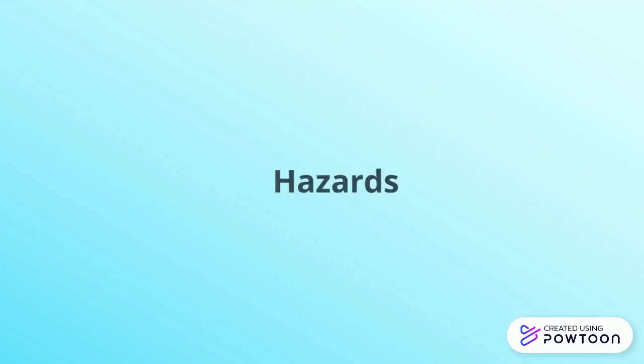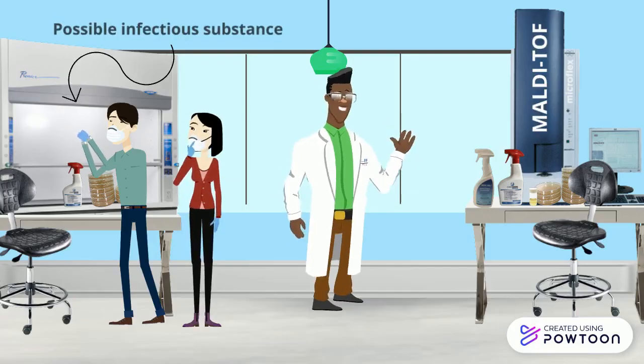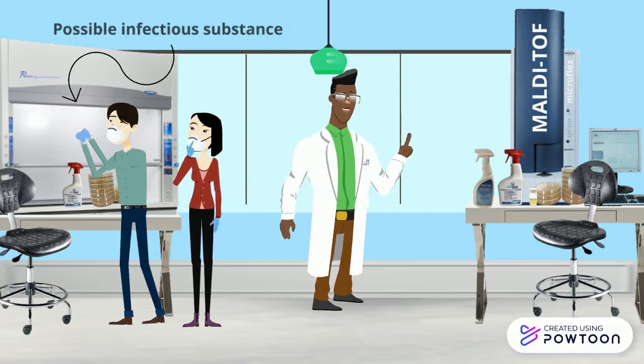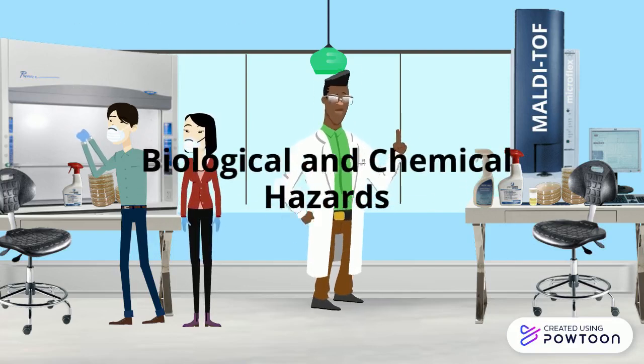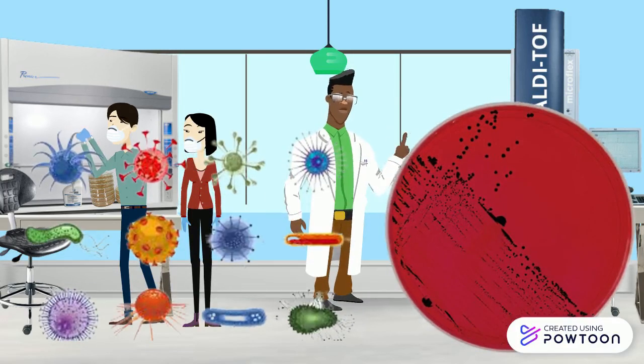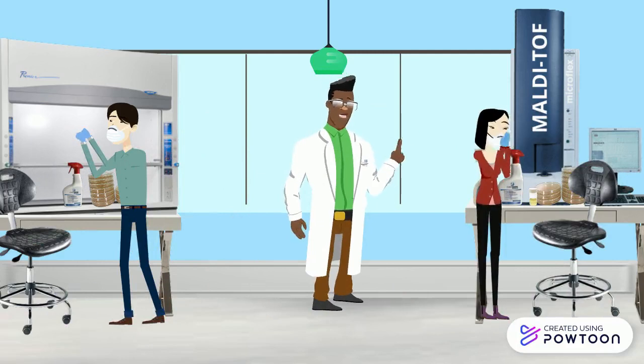Discussing hazards is another important aspect of health and safety. A hazard is anything that has the potential to cause harm to a person. Hazards encountered in the lab are mainly either biological or chemical. Biological hazards refer to microorganisms, cell cultures and human endoparasites that are capable of provoking infection, allergy or toxicity.